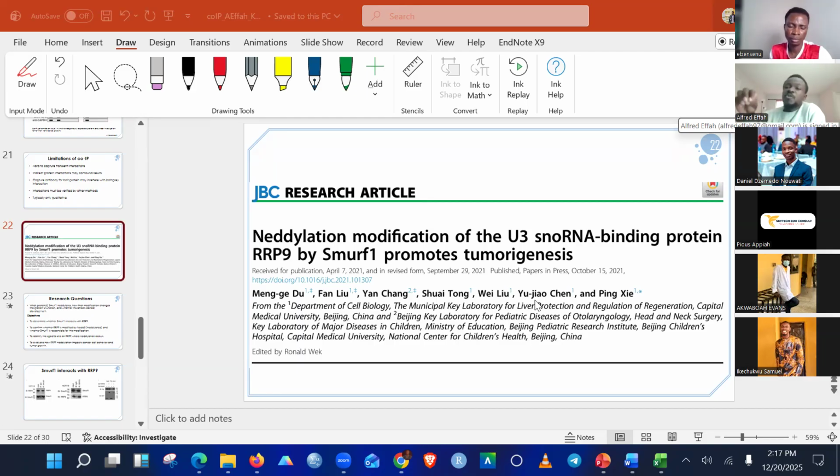Okay, you make sure you use inhibitors to mimic what it used to be in vivo, because maybe the interaction is only possible when the phosphate group is present. So before you even begin your experiment, you must know all these characteristics of the protein or the things you are interested in, else you miss it.